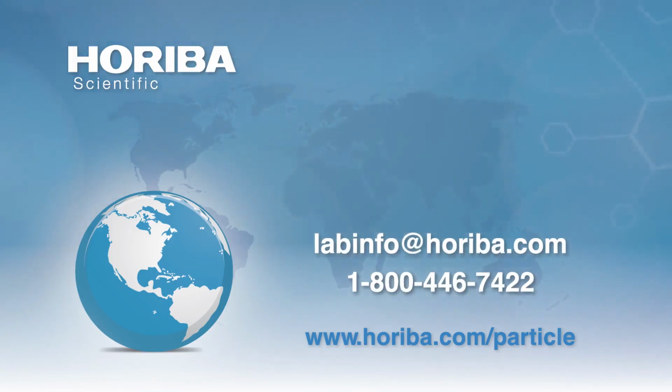Now you can actually remove a lot of it by treatments. You can do things like corona discharge. But ultimately, every surface, somewhere or other, will have some sort of fundamental charge stuck there as well. Now, again, polymer latexes we can work with in suspensions. Of course, you can't measure the zeta potential of a sheet of polymer using microelectrophoresis. I showed earlier that there are other techniques to be able to do that, but functionally, yes.